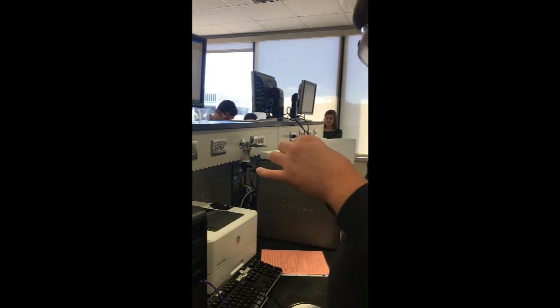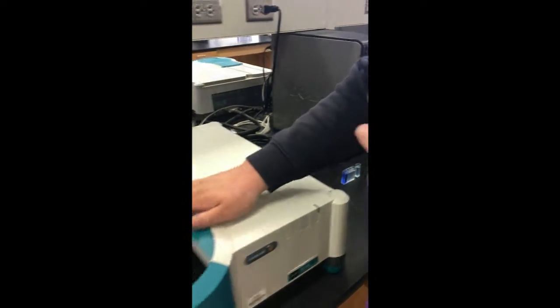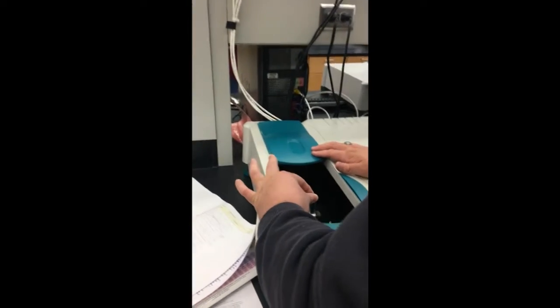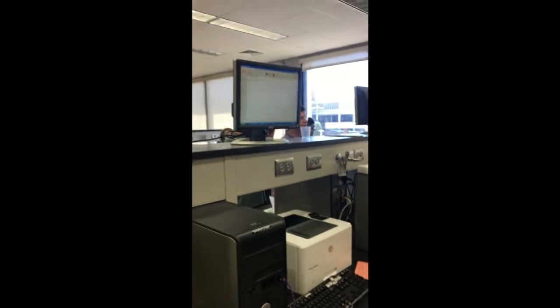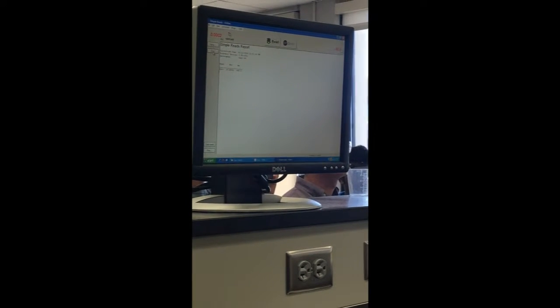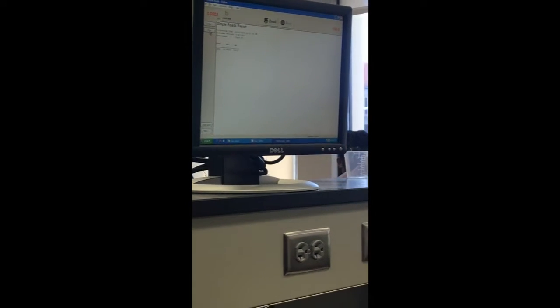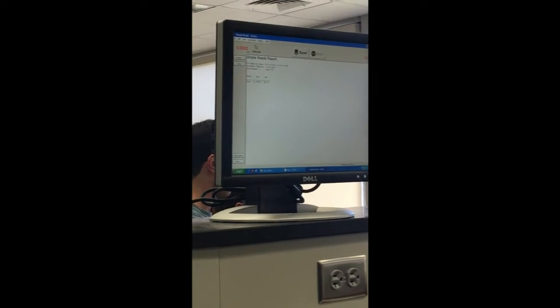Now that we have the samples, we must use the spectrophotometer and select the blank cuvette. This cuvette has all of the carrier solvents except for the substance being measured. Now, wipe down two opposite, as opposed to adjacent, sides of the cuvette with the lab wipe. Then place this blank cuvette into the spectrophotometer with the clean sides in the beam. Close the spectrophotometer's lid and zero the machine. If done correctly, the red number at the top left should either equal 0 or a very, very close number.